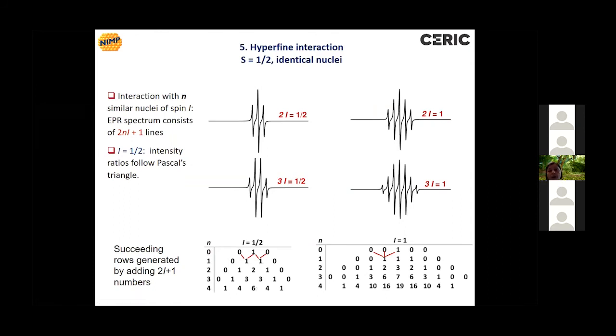Now I will turn to the hyperfine interaction. In the course, I have presented the situations for interaction with a single nucleus. Here are some examples of coupling with several identical nuclei.